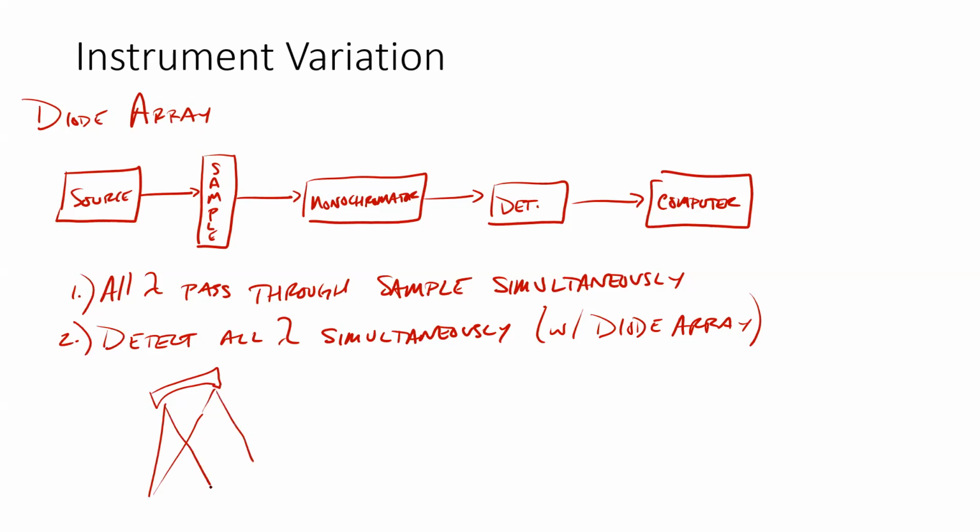It's going to hit our grating. That's then going to diffract, of course, different colors at different angles. Let me throw green in there.